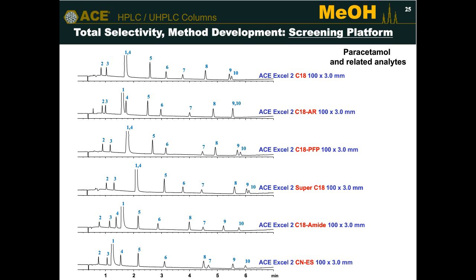Of course, the difficult situation is where you are given, which is a situation I'm very familiar with, I worked in the pharmaceutical industry for a long time, degraded samples, or a sample where maybe there's one compound or two compounds that they know is in there, but there's a whole host of other stuff in there. In this example, selectivity is actually your friend, because you can use different column chemistries to try and, very crudely, count the number of peaks that you have in your samples under different conditions.